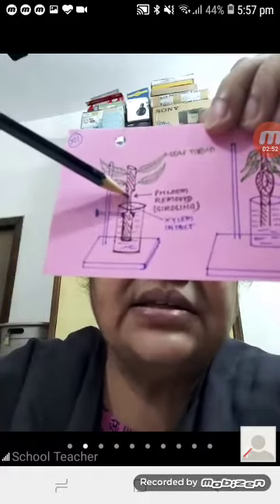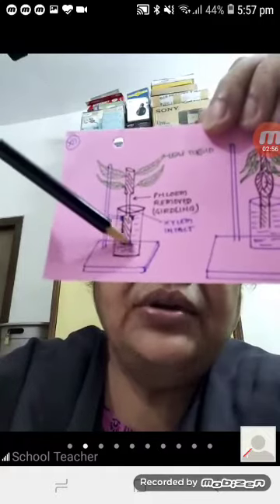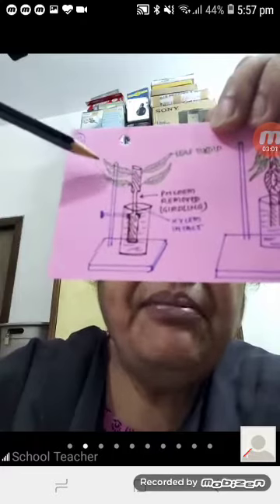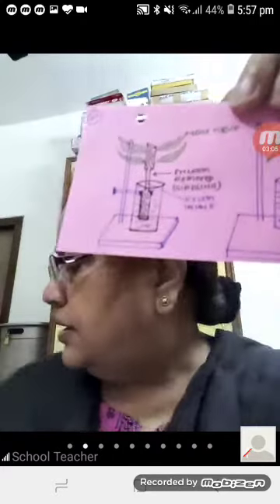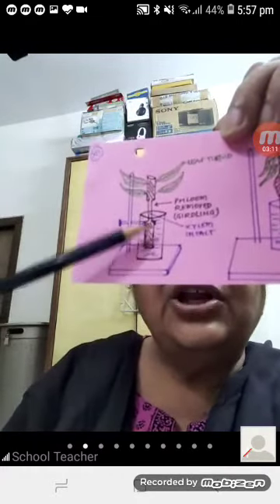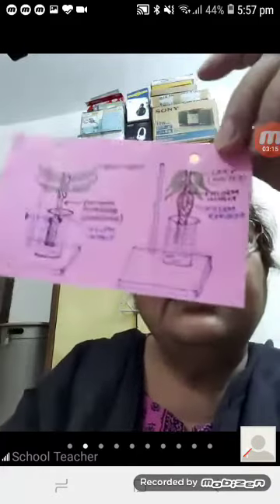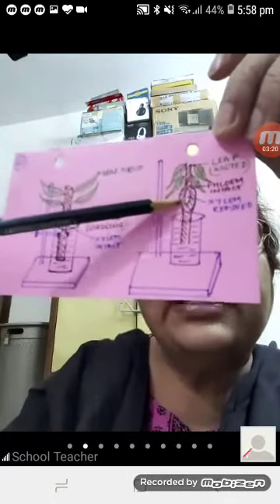The xylem is intact, so water being supplied to the cut end of the stem will move upward and the leaves will remain turgid. You can see the leaves are turgid because xylem is continuing to supply water.